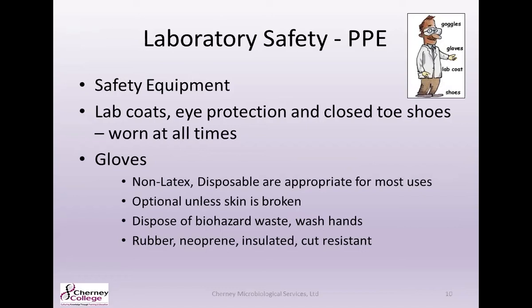Usually we'll need non-latex disposable gloves. In some cases, gloves may be optional unless your skin is broken. So even something as small as a paper cut could potentially allow pathogens to infect you. So if you're not using gloves, make sure your hands don't have any cuts and make sure that you're definitely increasing your hand washing frequency.